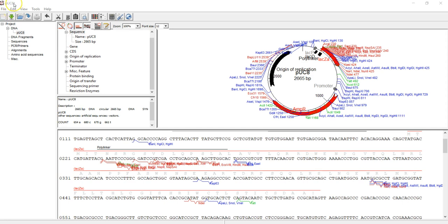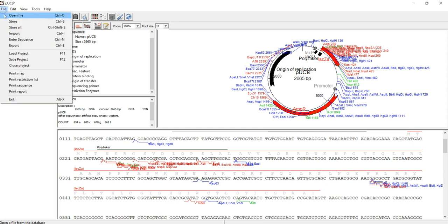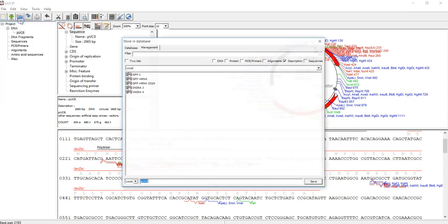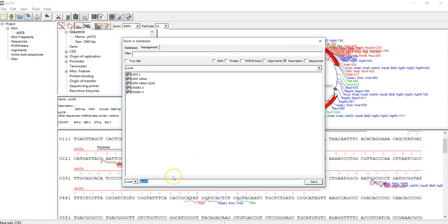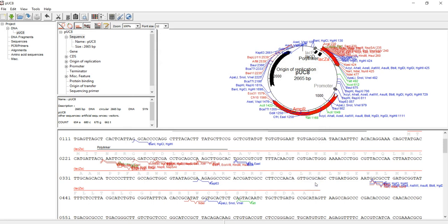After you open it, an asterisk will show up so you can save this molecule. First, just click Store, then give it a name—same name, pUC8. I have to save it.